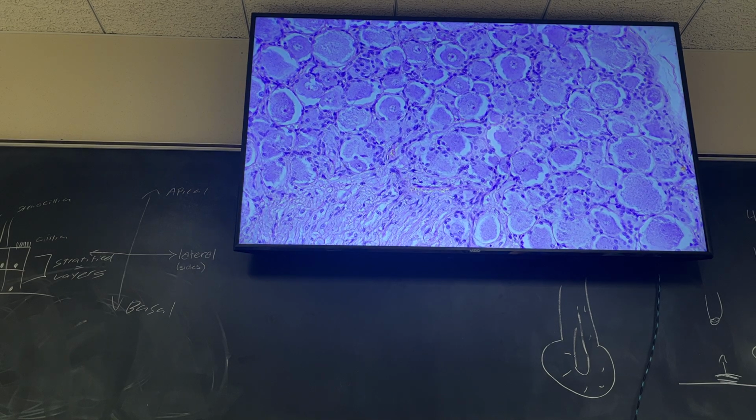that we've got kind of two sets of cells, right? So you have these big structures in the middle. Notice that one. Big structures in the middle. Those are cells. So you've got two options: capsule cells and ganglion cells. Which one do you think? Well, that's probably the ganglion cells, right? The big ones. The capsule cells are these little guys around the outside that form a capsule around the ganglion cells.